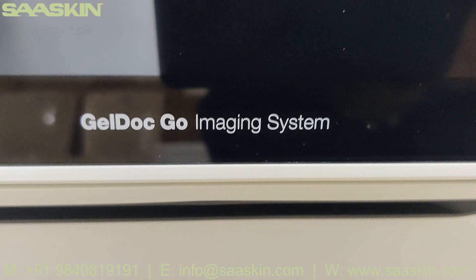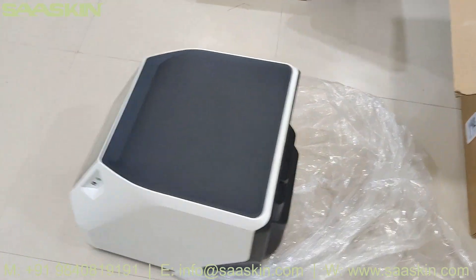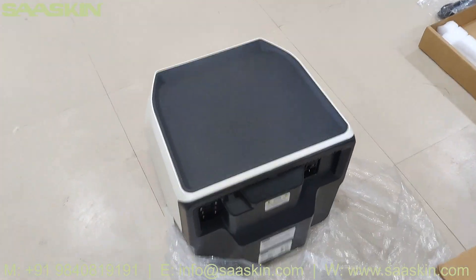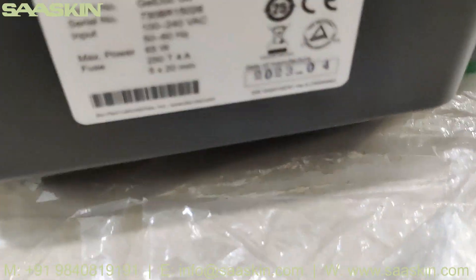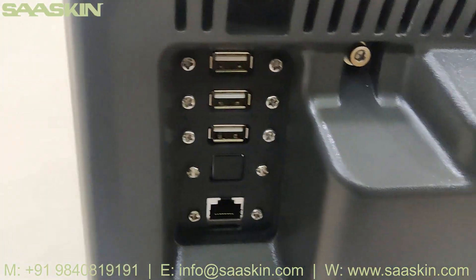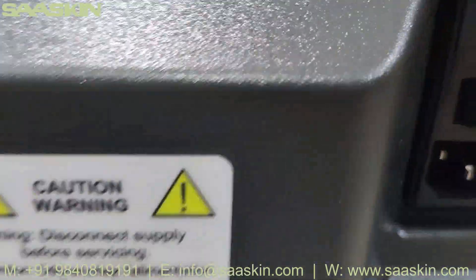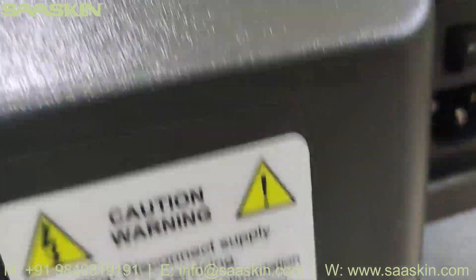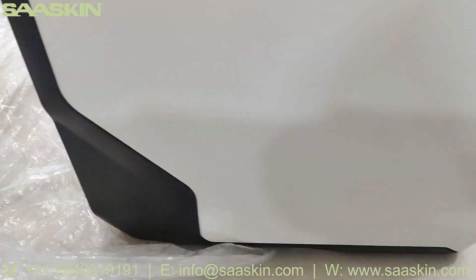This is the GelDoc unit system — just going around to show how this machine looks like. On the back side you can see the necessary USB ports, ethernet cable ports, the power cord connection point, and also the details of the machine label.